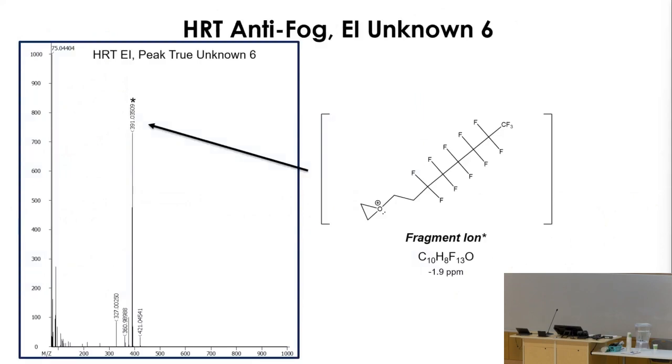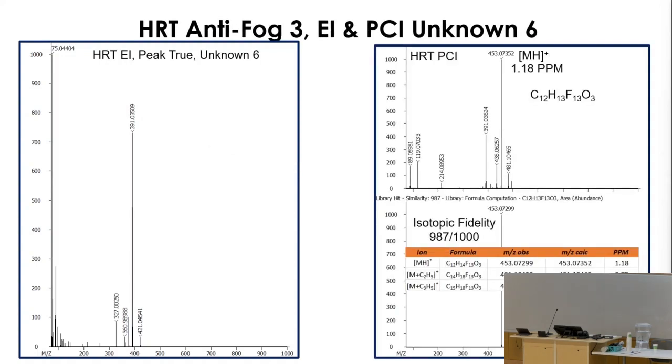Furthermore, once I have that information, I can determine perhaps potential structures for the other unknowns, because I have an idea of what X is now. What about 6 through 14, where they're actually related, which is kind of neat. And I can start speculating about structures like this oxonium ion for particular fragments for unknown 6 now. So I'm going along the line.